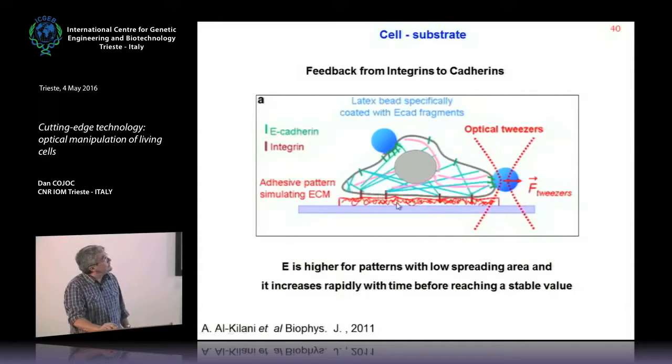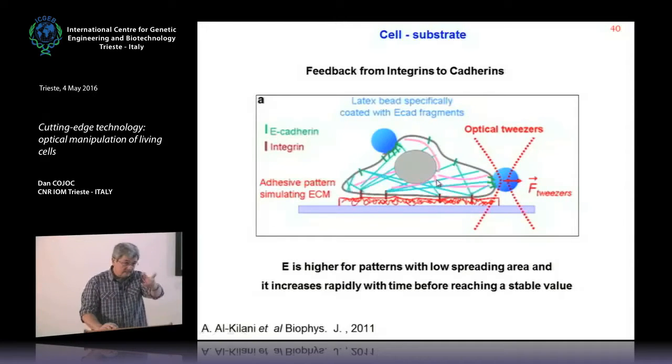Another group analyzed the interaction with the substrate. There is material on this, but I do not have time to enter into detail. Here is a nice experiment where they analyze the adhesion between a bead functionalized with cadherins and the cell when the area of the pattern on which the cell is plated changes.